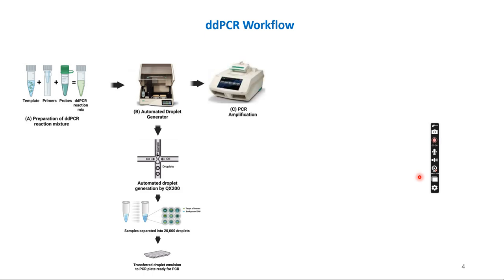And after droplet generation, we go for regular PCR, and we follow the regular PCR techniques, like the annealing temperature. We change it for a good amount of PCR amplification to avoid non-specific binding. But I'm not talking about the details of how you can set up a good PCR. You will follow each of these methods, rules of thumb, and techniques to continue your PCR.